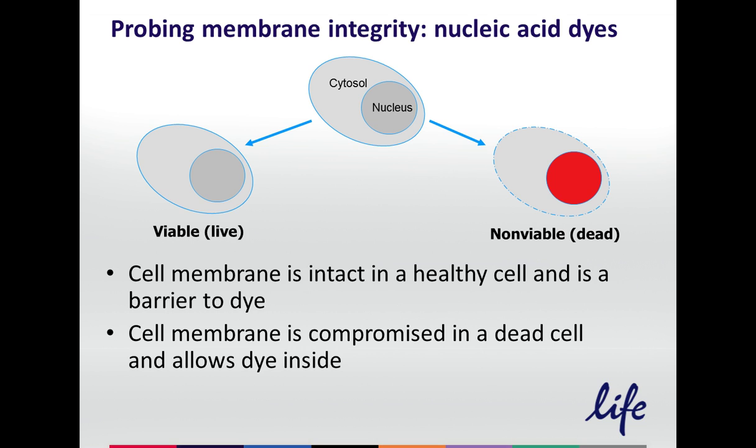The reason why they're fluorogenic is when the nucleic acid dye binds to the DNA, it could be a minor groove binder or intercalator. Essentially, normally these dyes have free rotation around a carbon-carbon bond, which allows the energy to be lost without fluorescence. However, when they bind to DNA, they're locked into a rigid structure, which gives rise to a very bright fluorescence from the dye. And so these are particularly nice tools for using in a wide range of scenarios.